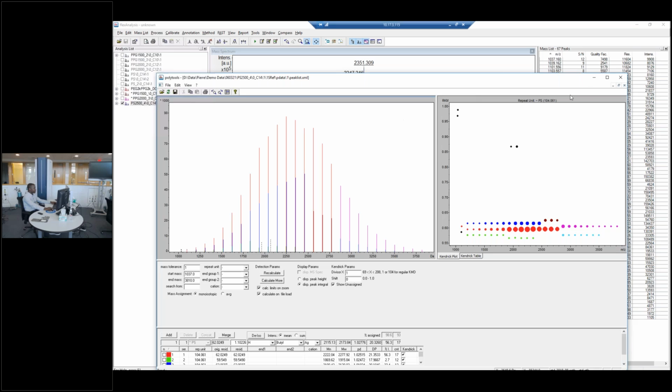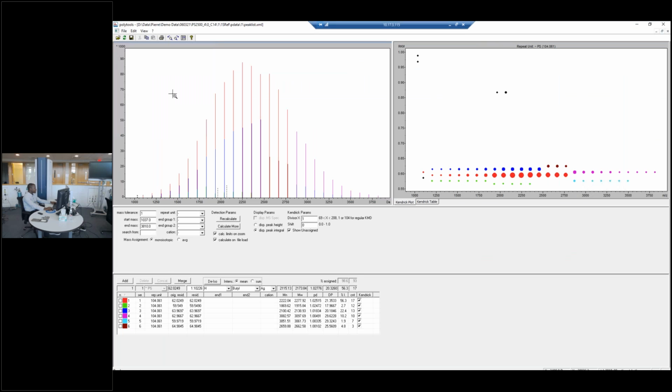interpretation. And Polytools is our dedicated polymer analysis software, and this is where you basically get to calculate all of the interesting polymer characteristics that any polymer chemist is interested in. So things such as molecular weight, polydispersity index, the degree of polymerization of your sample. If you have different mixtures and different end groups, Polytools will give you basically a better understanding of what you have in your sample.